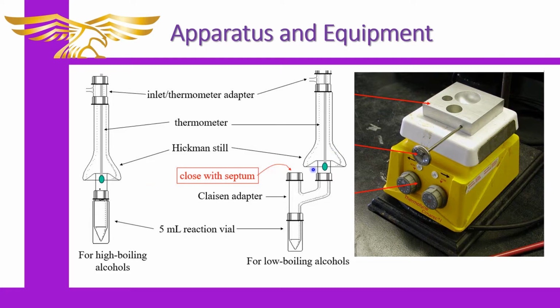It depends on what you're working with. Like if you know most of the product that you're going to form is going to boil up into the top, sometimes you don't bother with the thermometer and you just collect it. But it's a better practice to use the thermometer because, again, you want to make sure that you're actually collecting over the temperature that is relevant to the products that you would like to collect for the most part.